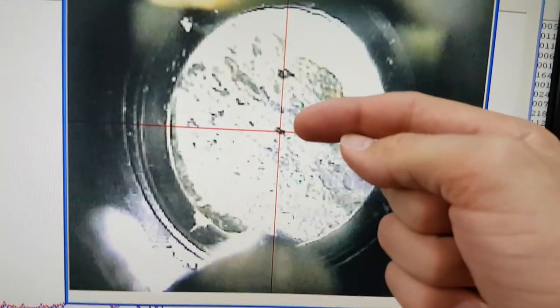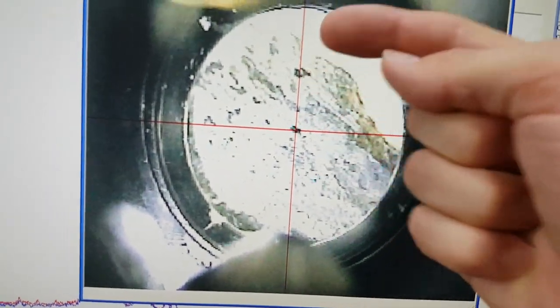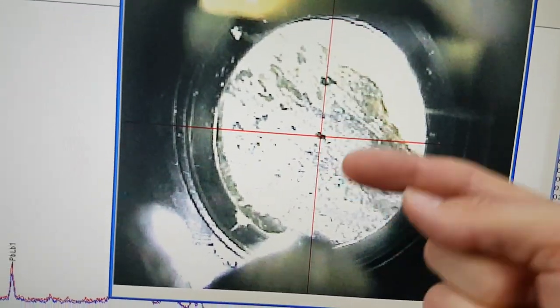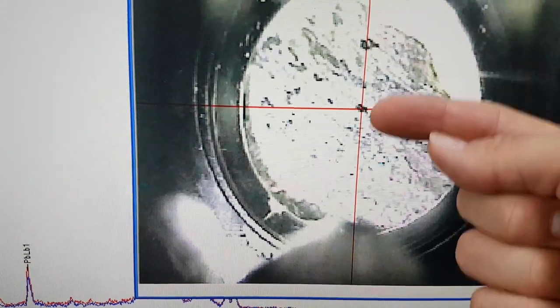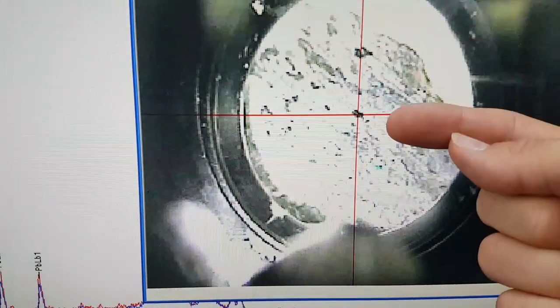We assumed these two pieces might be in the same solution loop. They looked a similar shape, although this one does have a very large crystal in it. I wish I could get an SEM of that. We wanted to see if these two affected areas had a similar distribution of elements.